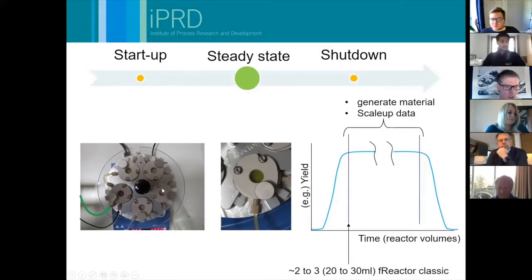Okay, and then I'm going to go into my, well, in this case, a physical transformation phase. So I would turn on my aqueous pump and I would turn on my oil pump, and you can see it takes a few minutes for our material to flow from the inlet to the outlet. So you can see, I think, probably just in these two reactors, it's starting to turn green, whereas these are still clear. So we have this startup phase where our materials are coming together for the first time.